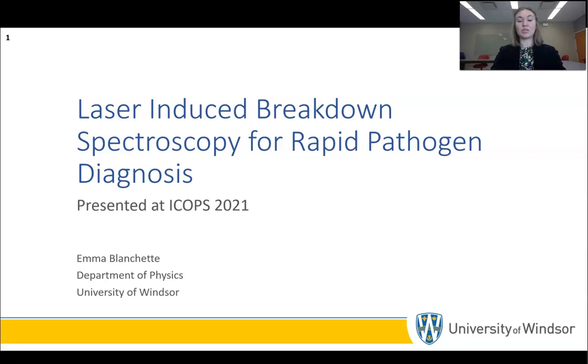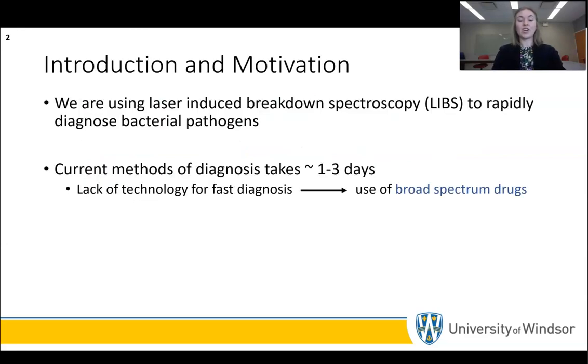I'm a master's student at the University of Windsor, and today I will be talking to you about the use of laser-induced breakdown spectroscopy for rapid pathogen diagnosis. Our lab group is investigating the use of laser-induced breakdown spectroscopy, or LIBS for short, to quickly detect and diagnose bacterial pathogens for use in a clinical setting.